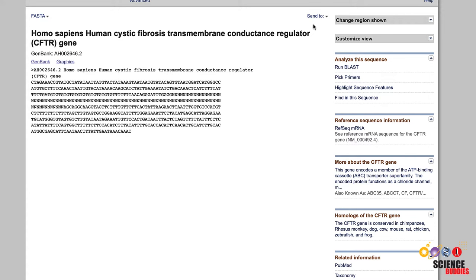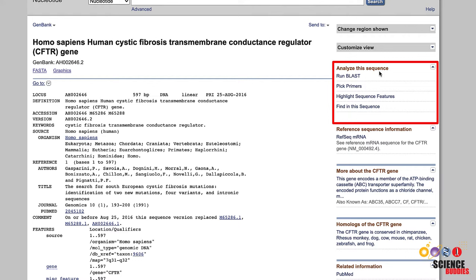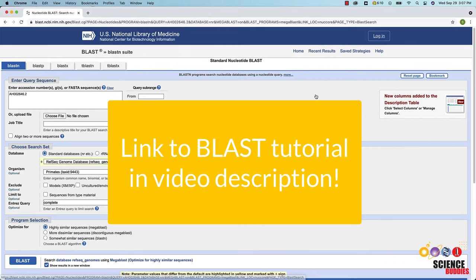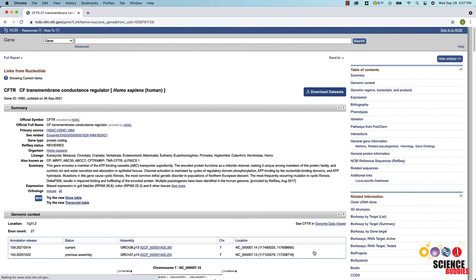You can copy and paste the FASTA sequence to transfer it into another bioinformatics tool such as BLAST. You can also download the FASTA file by clicking on Send to, check File, and then click on the Create File button. Under Analyze the sequence on the right, you have the option to analyze the sequence using other bioinformatics tools. For example, clicking on Run BLAST brings you to the BLAST homepage where you can compare the sequence to many other sequences in the database. Further down the page, under Related Information, you can get more information on your nucleotide sequence. For example, clicking on Genes brings you to a page with related genes in the gene database. We will talk about the gene page in more detail later in this video.